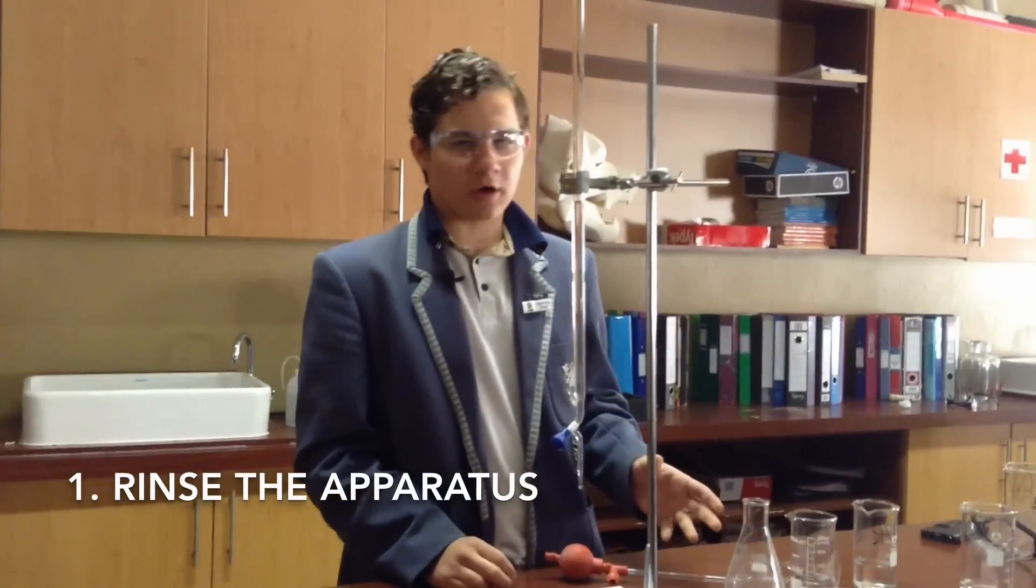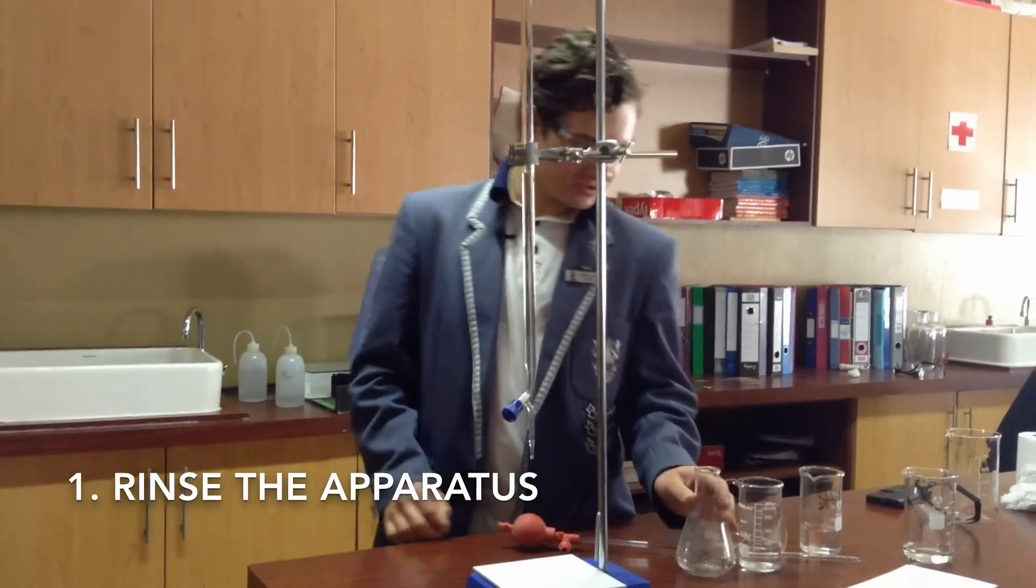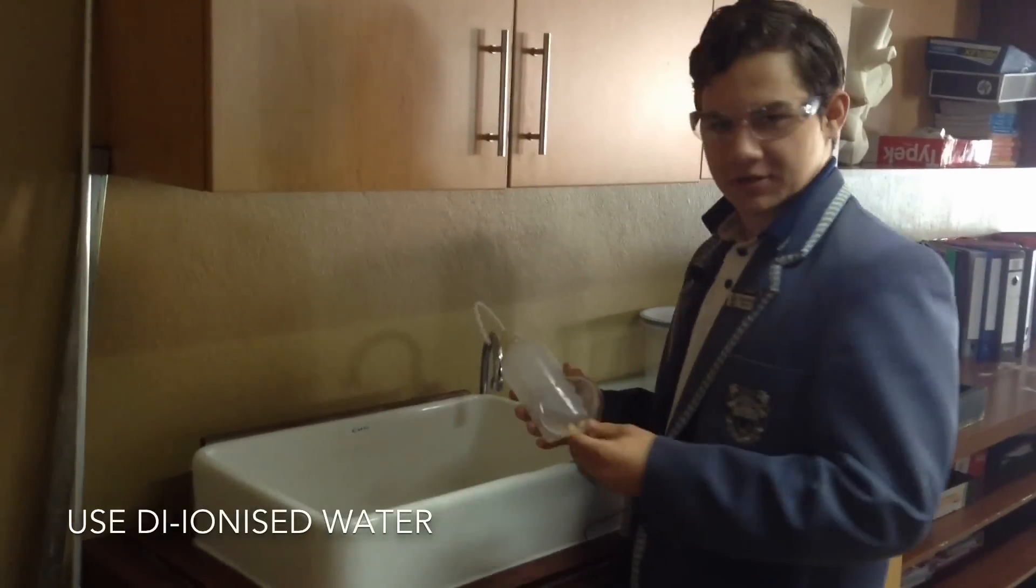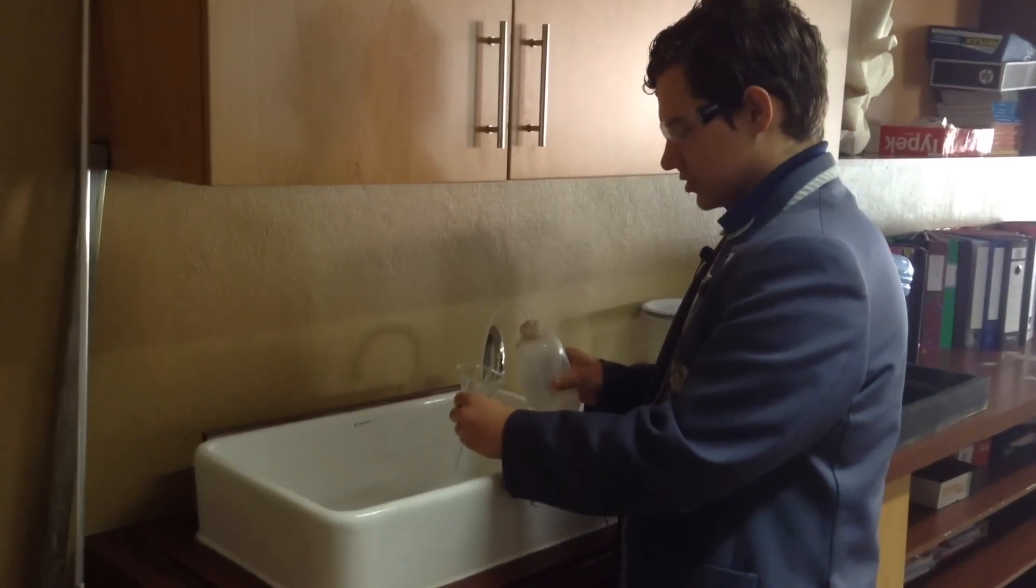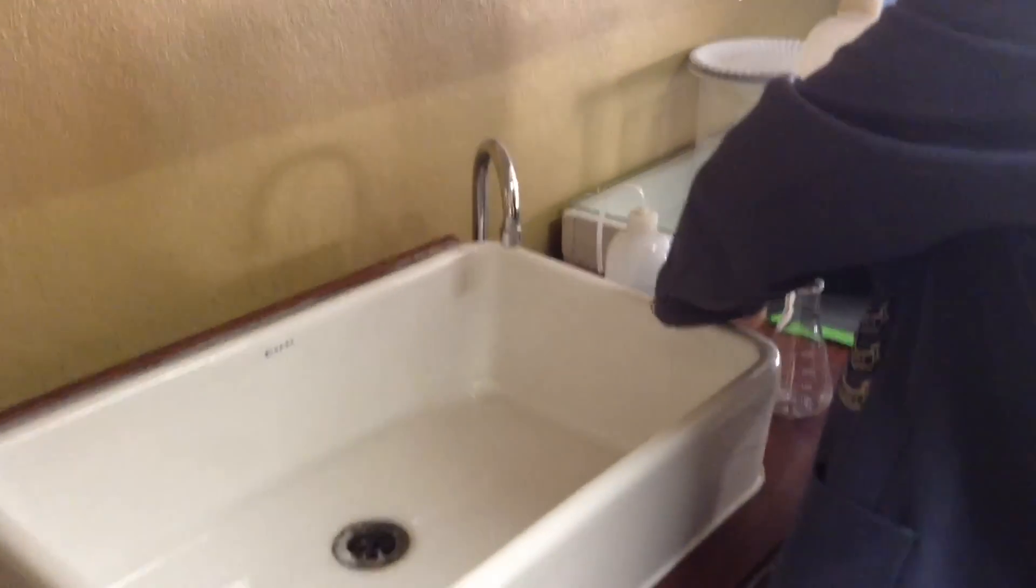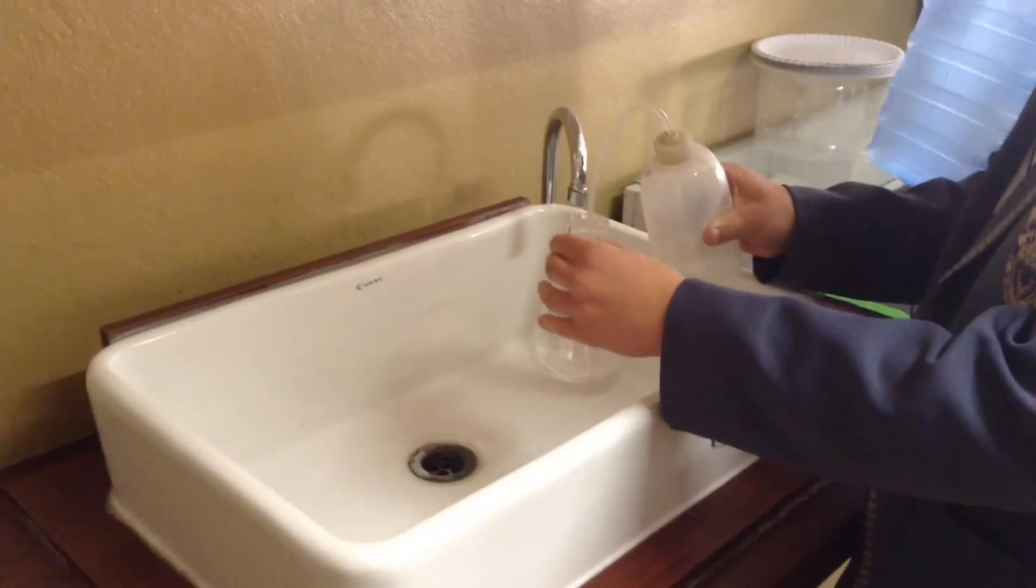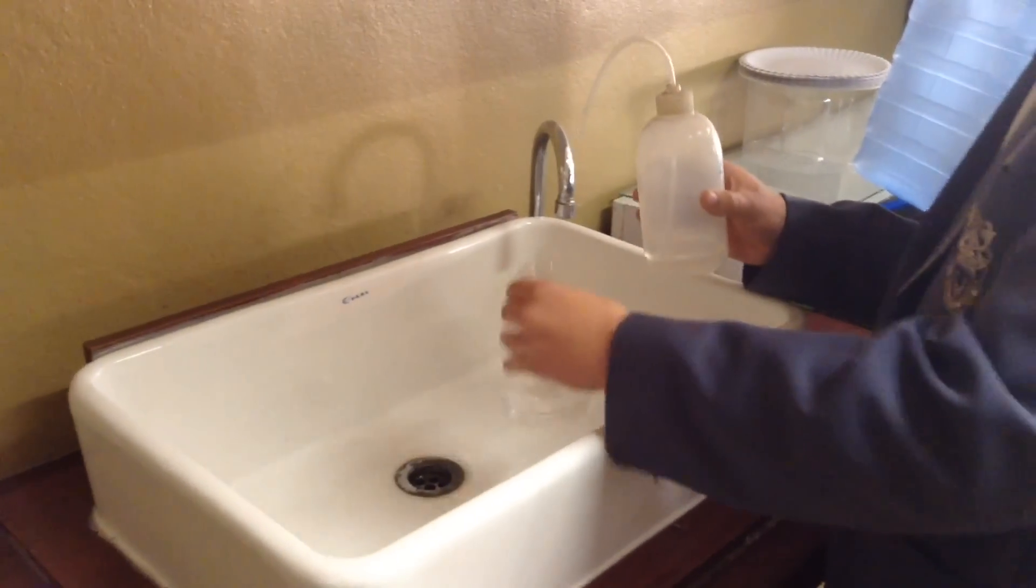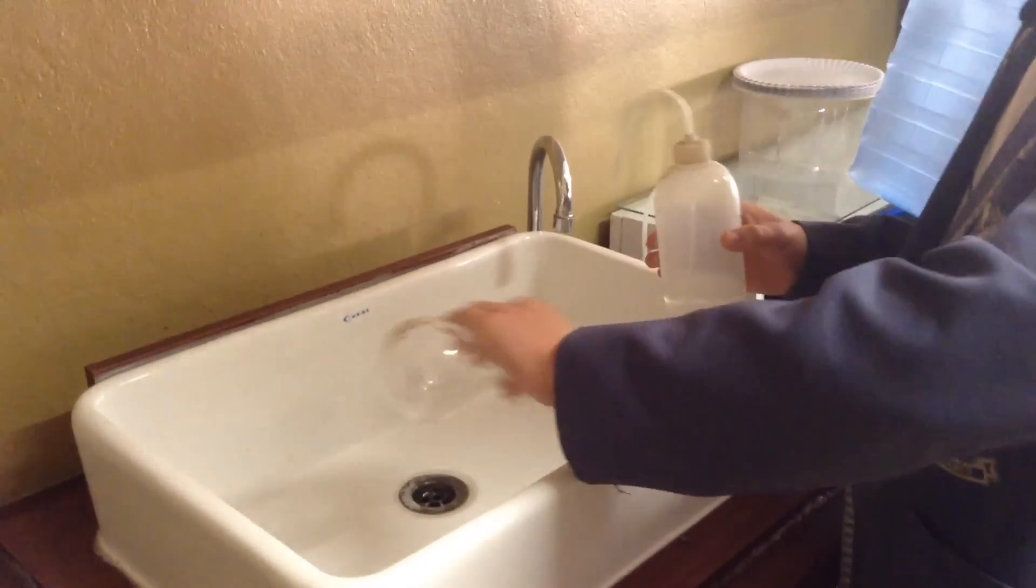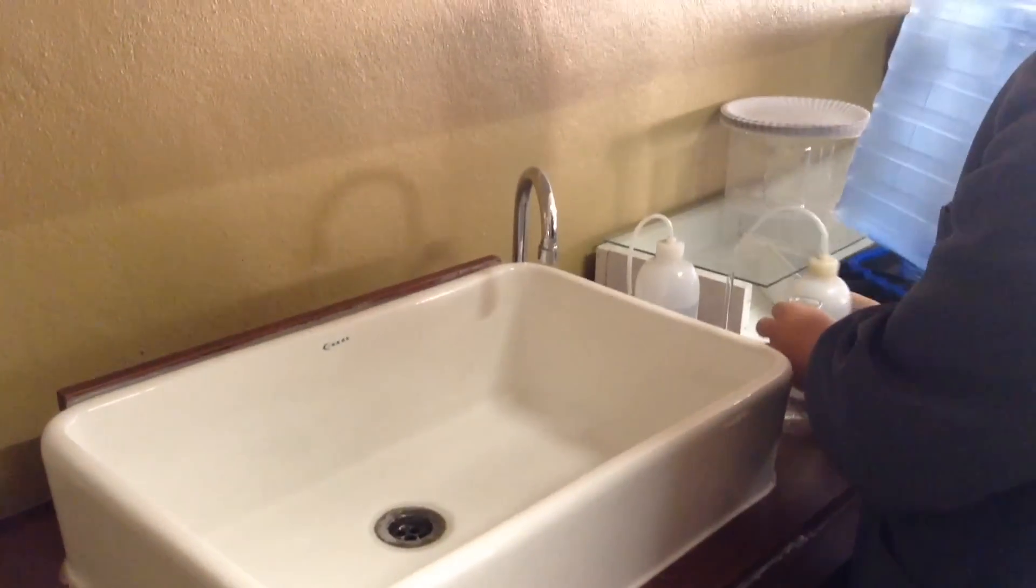Okay, so before we start with anything we need to first rinse all our apparatus. So we're using deionized water because it obviously doesn't react. We're just going to clean our apparatus - conical flask - make sure to clean inside and rinse, and also make sure to clean the neck. Don't clean your burette because we're just going to fill it up with our known solution.